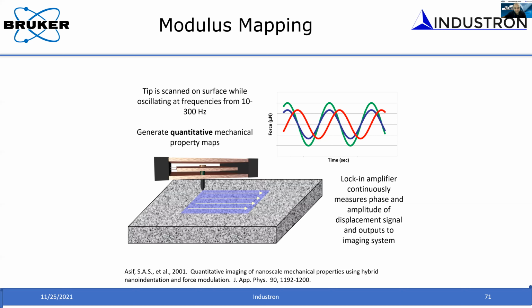The next question is from Indrajit Kumar. What changes in instruments do we need to make in a room temperature nanoindentation setup to perform high temperature creep testing? First of all, you need to have that high temperature heating stage. It's a unique stage, designed so that the thermal drift has been taken care of.